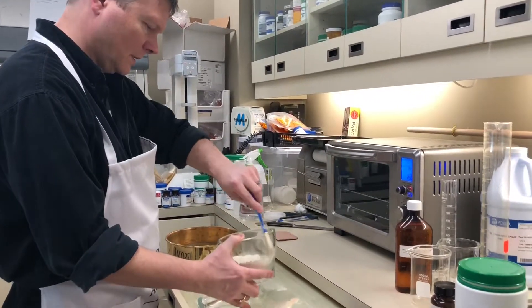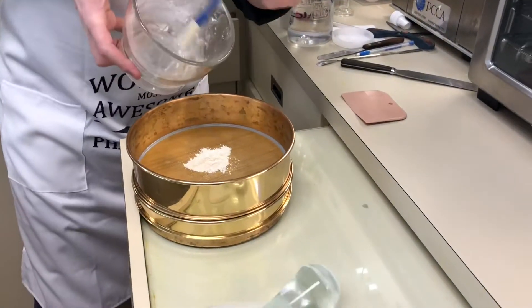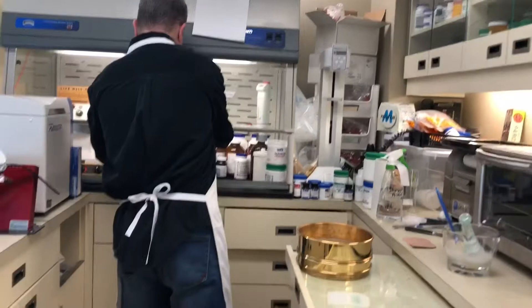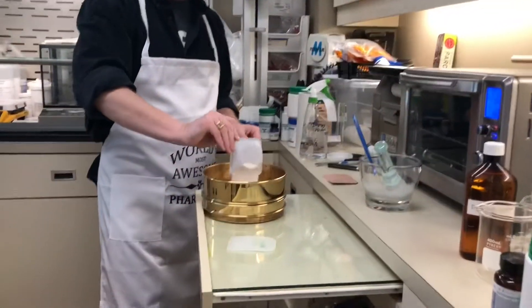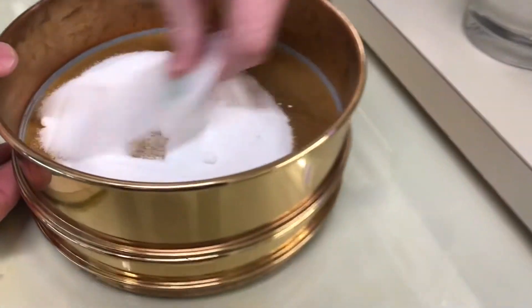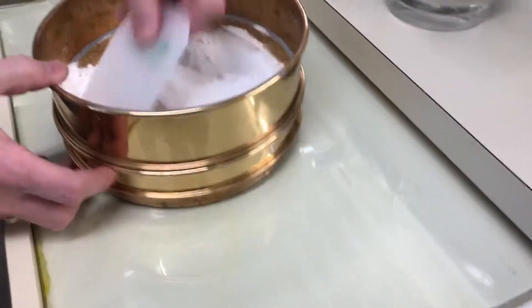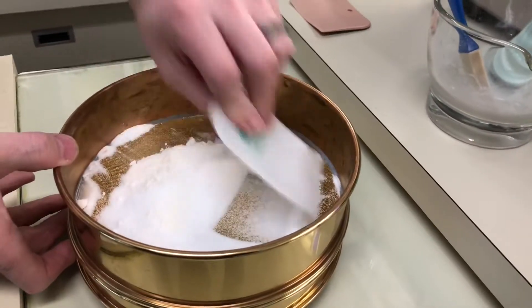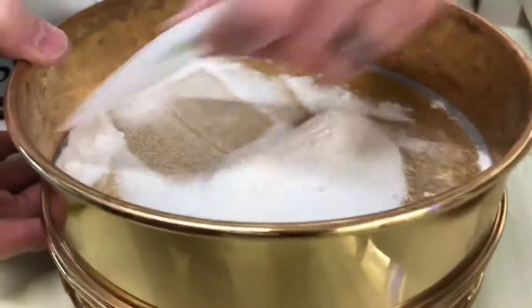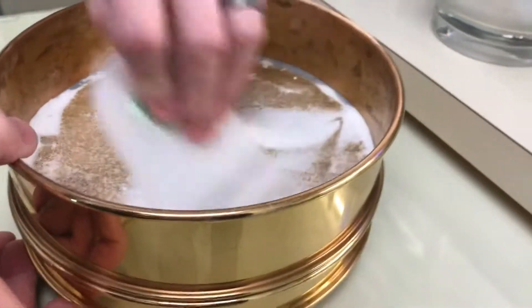I'm going to put just those ingredients in here, just going to let the powder go through. We're also going to take the RDT vehicle, which is a specialized vehicle for making these tablets. All we do is push the active, the base, and the flavoring agents all through. It takes a little bit to work through. We don't want to put the RDT base through the mortar and pestle like we just did with the other ingredients.